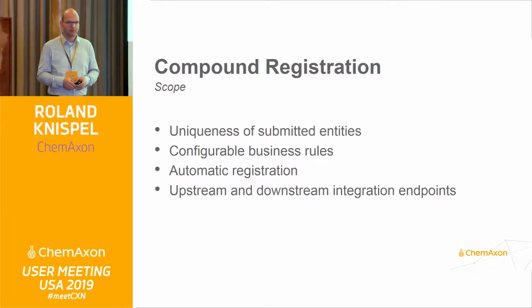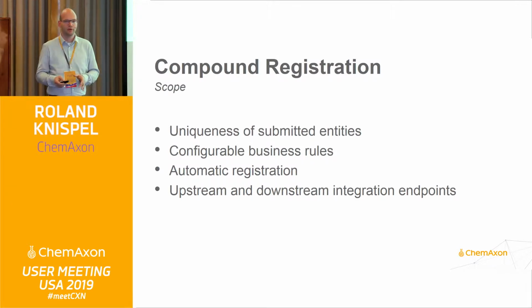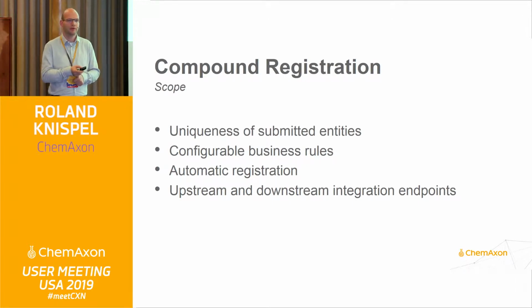Primarily, it's there to give you the opportunity to maintain a catalog of unique substances that you may have produced, synthesized, or somehow ingested from external libraries in-house in your organization. This sounds like a trivial task because all you have to worry about is uniqueness. But then again, across the different organizations that we serve, we see a lot of variability in terms of structure quality considerations, how a structure should be represented, as well as the peculiarities of stereochemistry, and how individual stereochemistries that aren't well defined should be handled by the system itself.